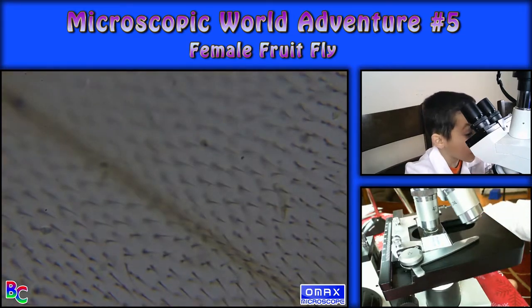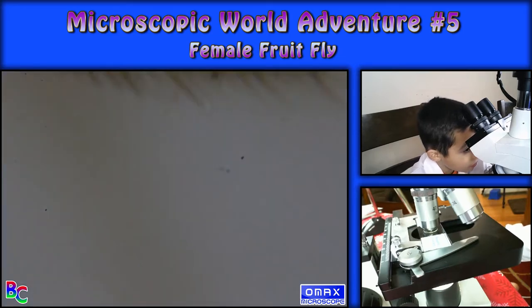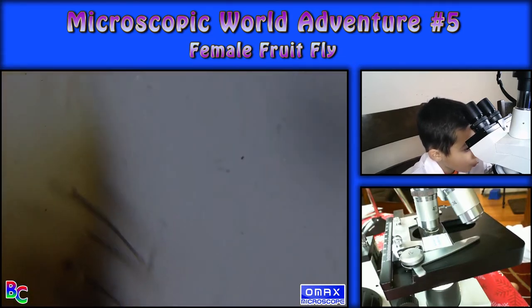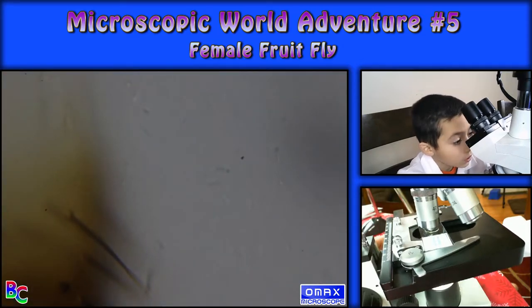Oh, there it is again — with the hair. Wow. What is that enlarged?